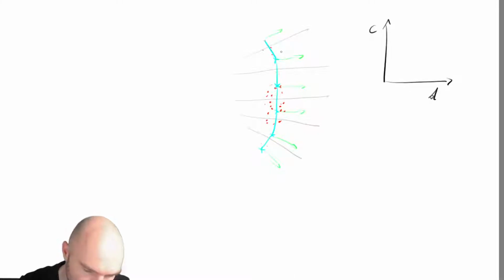I can view each of these sub-volumes, each of those Voronoi cells, as belonging to a vertex, maybe vertex 1, 2, 3, 4, 5, 6. And I want to create a proxigram, for example, where I take the subvolumes of vertex 3, 4, and 5 maybe, and then a separate one for 1, 2, and 6.